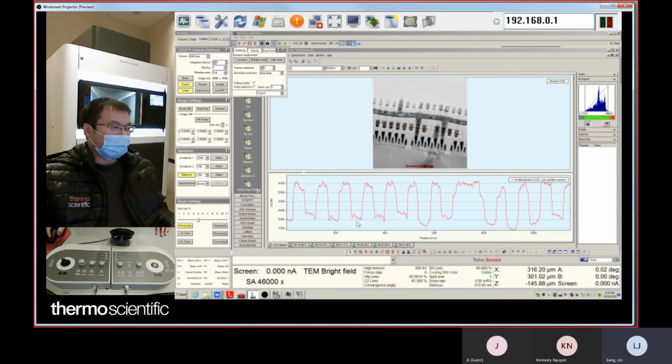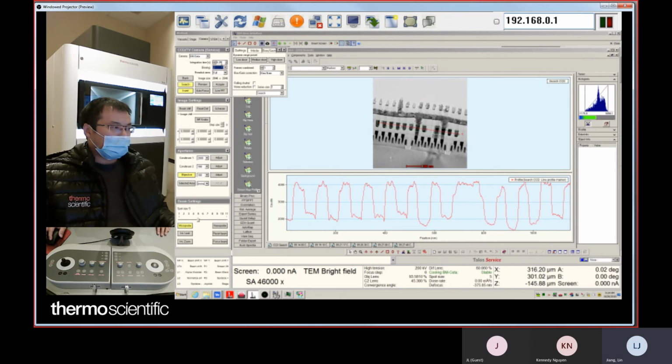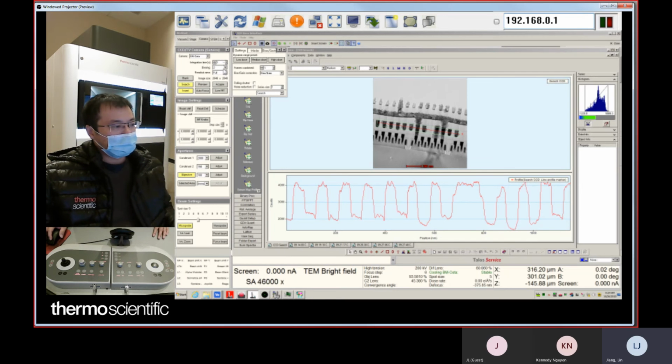But what if I want to further increase the count in my image? You can do binning. If you do binning 2 and you keep using the same 1 second, in this case, you can get 16,000 counts. It's over 8,000, but still safe because you're using binning, right? So now the max count is 32,000.